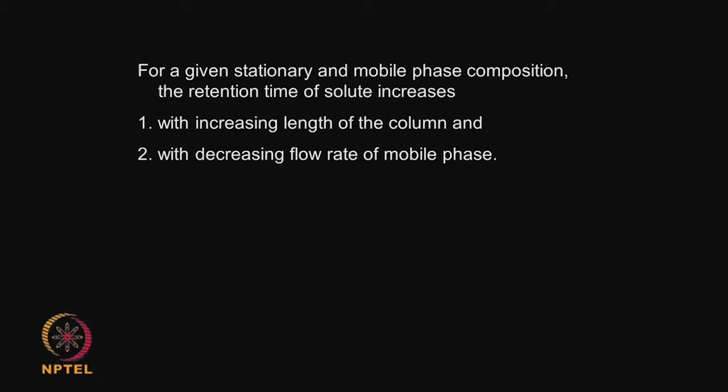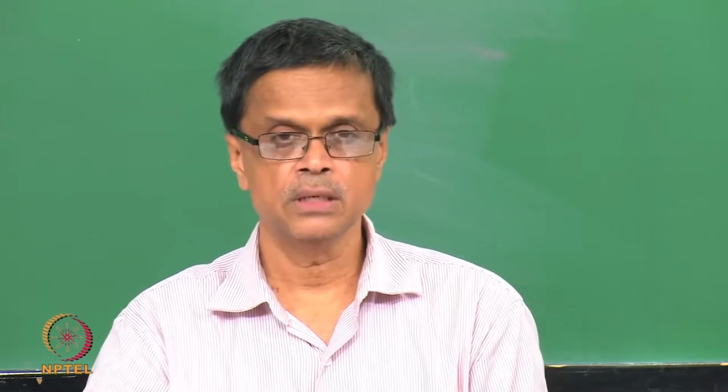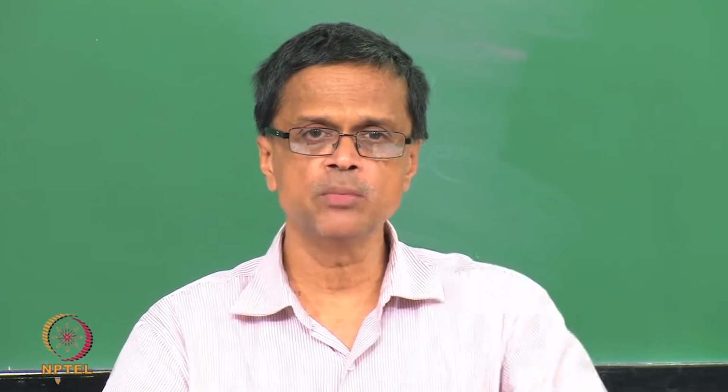Please note, I am not talking about the separation efficiency, but only about the retention time. If I have 2 components, then both the components will feel the same. If I reduce the flow rate, both the components will come out slower. If I increase the length, both the components will come out slower. Okay. Now, similar to retention time, you also have retention volume.